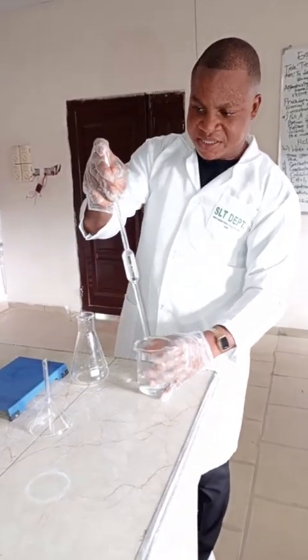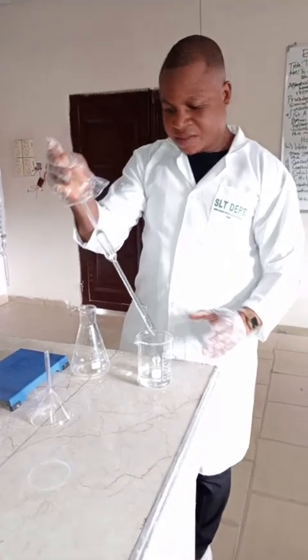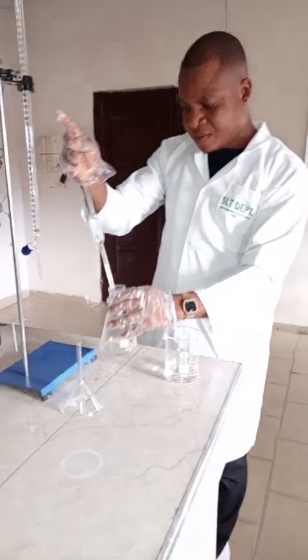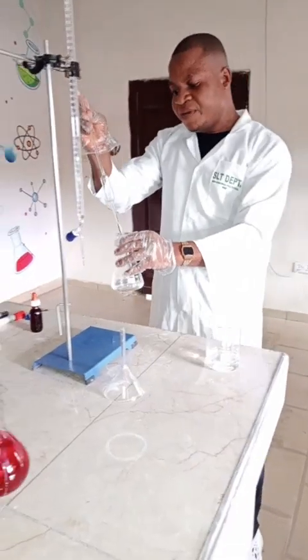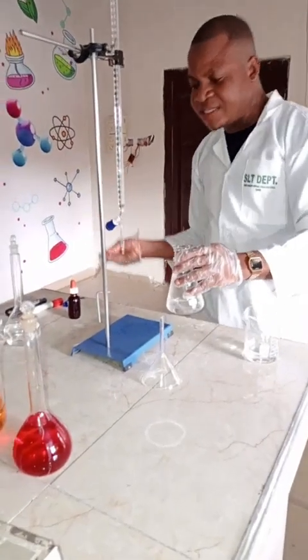Now I'm going to release it. Correct. This is around 25 ml of the base, 25 cm³ of the base, in my titrating flask.